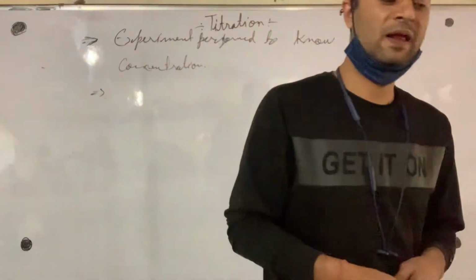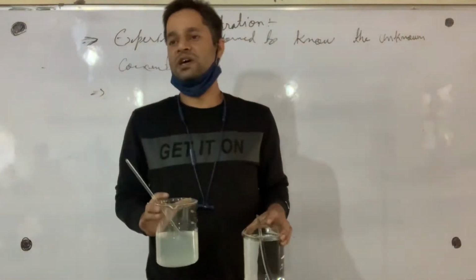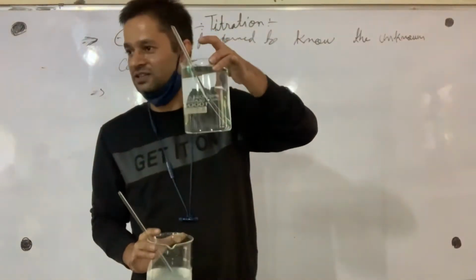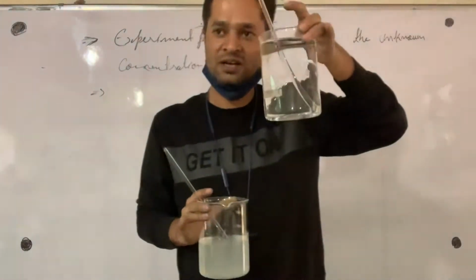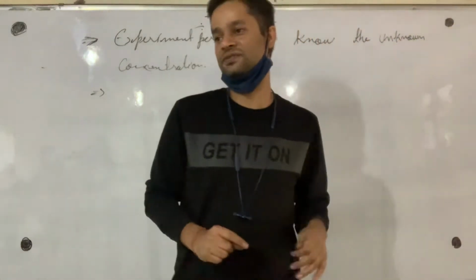Okay? So we will do titration today of sodium carbonate. Concentration of sodium carbonate is known. Concentration of HCl you don't know, meaning how much HCl I have added in 1 liter of water. So by performing titration, we will know the concentration of HCl.